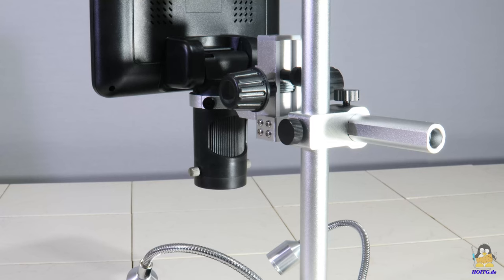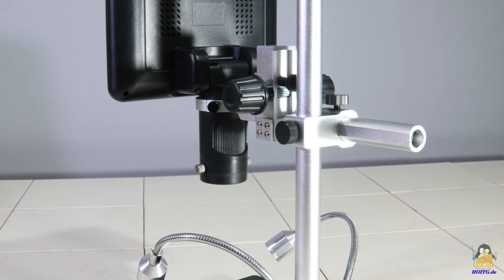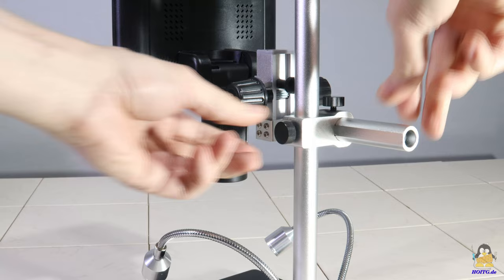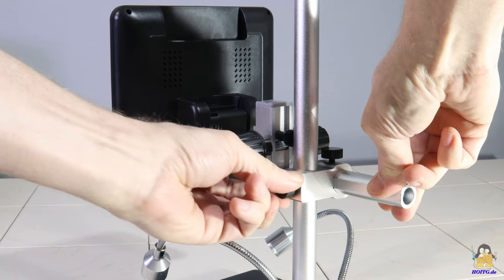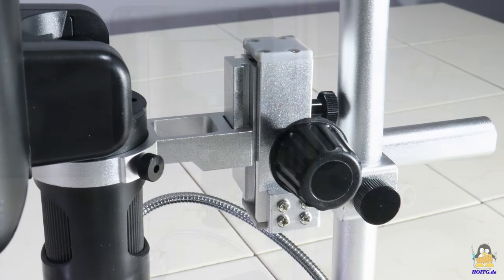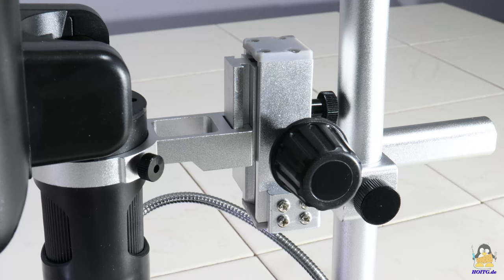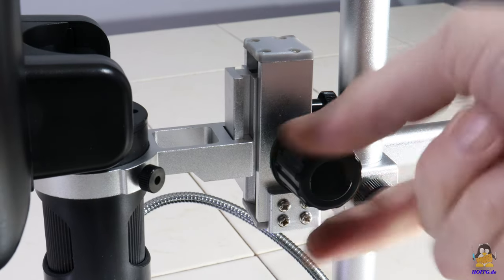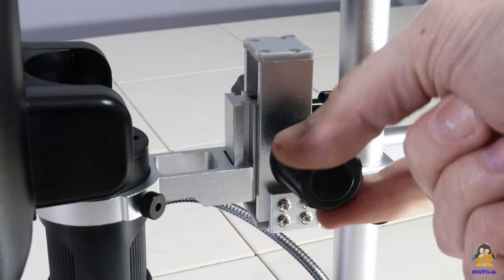The base and bracket are made of metal and look sufficiently solid. The height of the microscope can be roughly adjusted along the tube and fixed at any position with a knurled nut. The fine tuning is done via an adjusting wheel, with the help of which a stroke of up to 29mm is available.